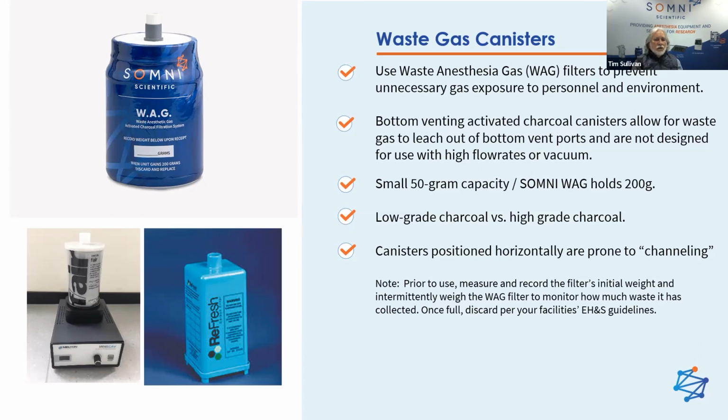These little fan-based systems with the charcoal filter sitting on top of them, all they're doing is drawing that air at a pretty rapid rate through the filter and just scattering it all over the room. So it really doesn't work all that efficiently.